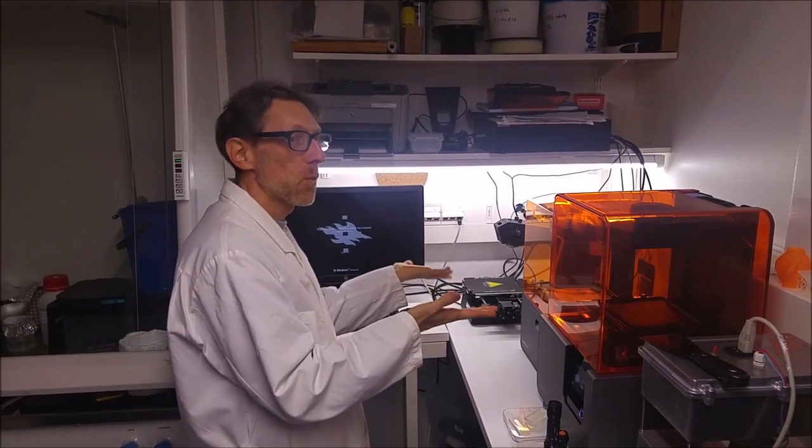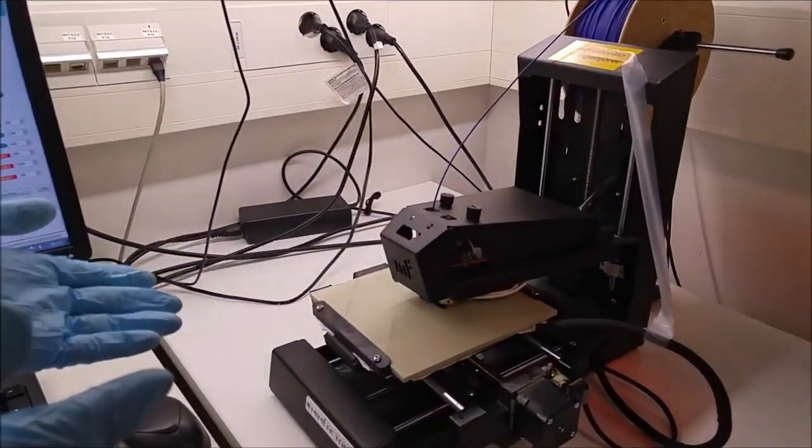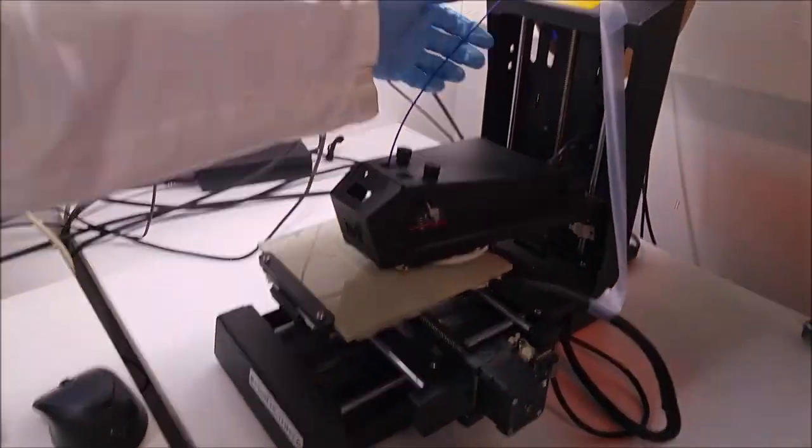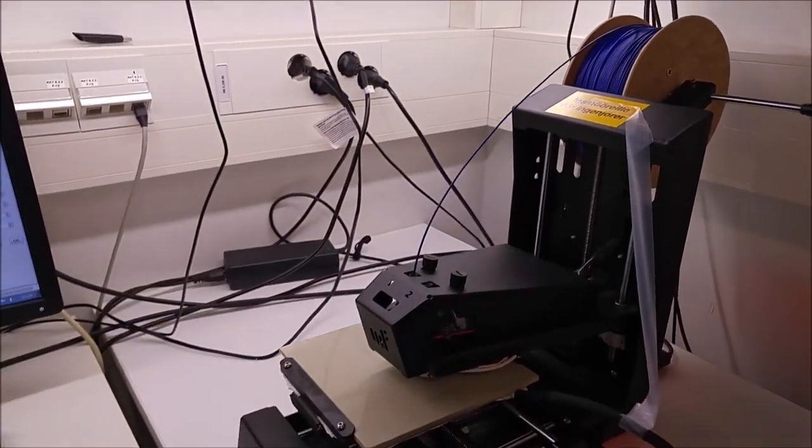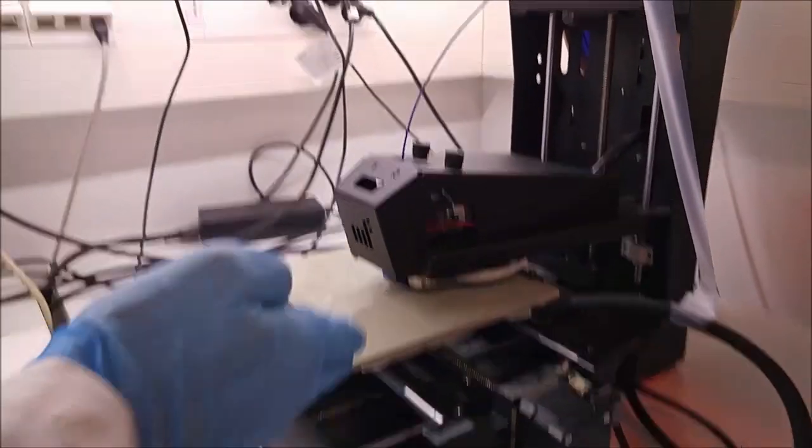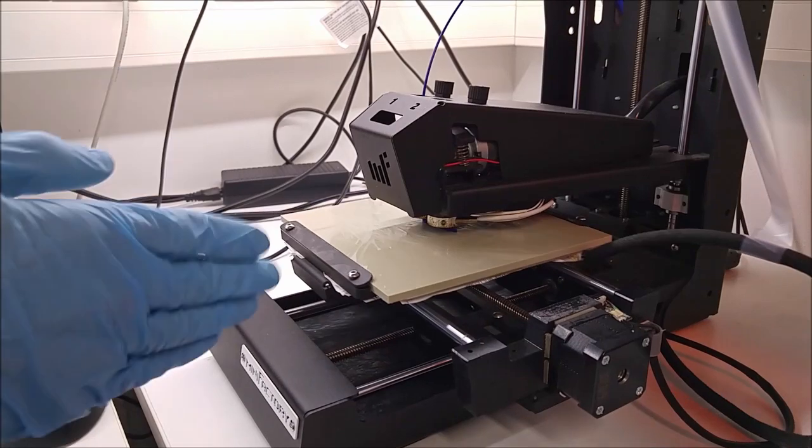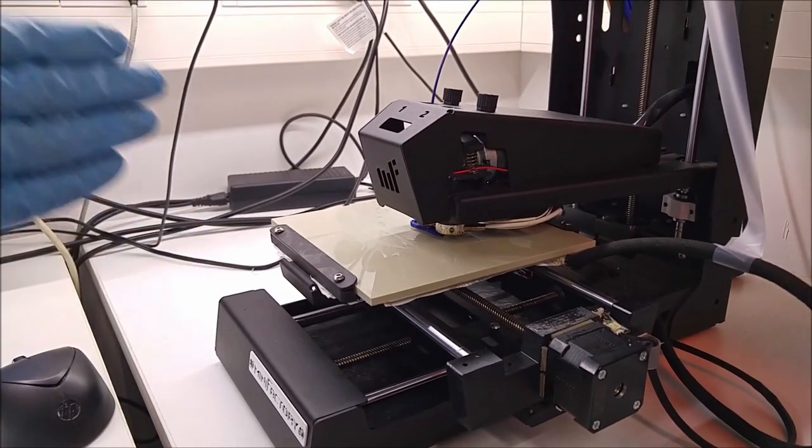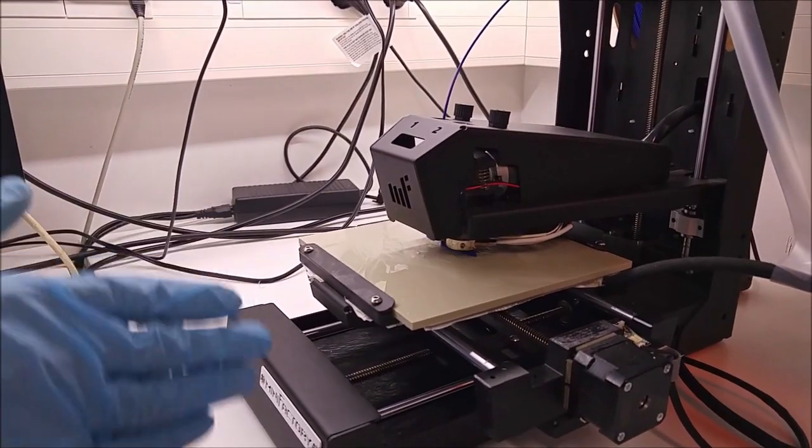We are now in the lab with all the 3D printers that we have. This is the FDM printer with which we are printing our micro-reactor. It has a polypropylene filament loaded and we are printing on a polypropylene platform. The material of this platform is important and in this case it is polypropylene because with other platform materials adhesion of polypropylene is extremely poor.